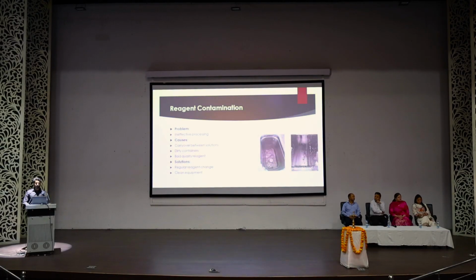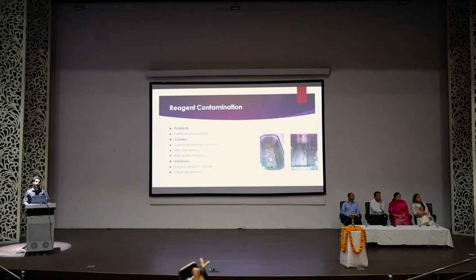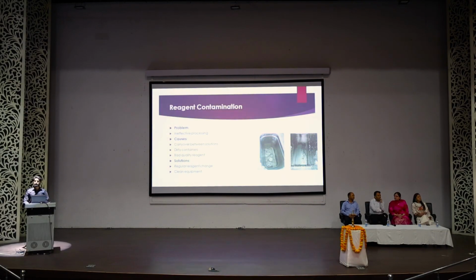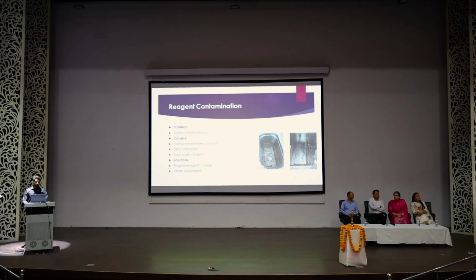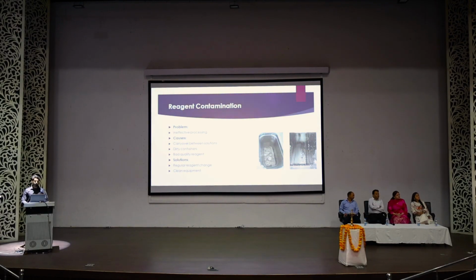As Fayaz already discussed some of the errors that we face in histopathology, some pre-analytical as well as analytical errors, in analytical errors I will start from embedding.